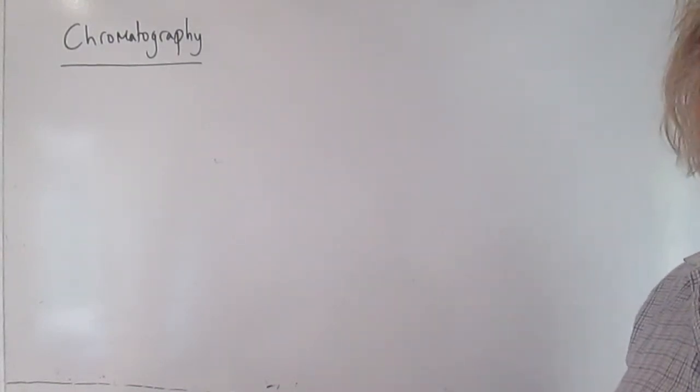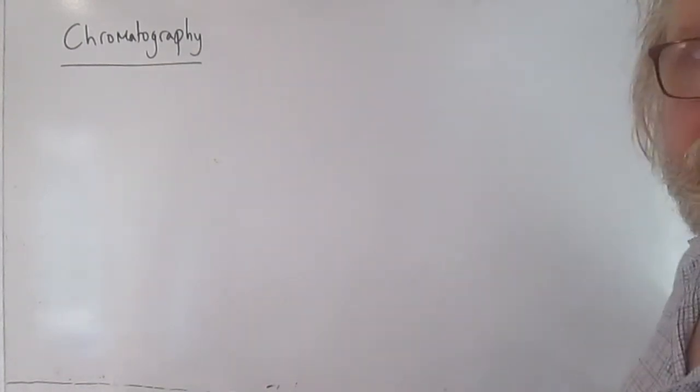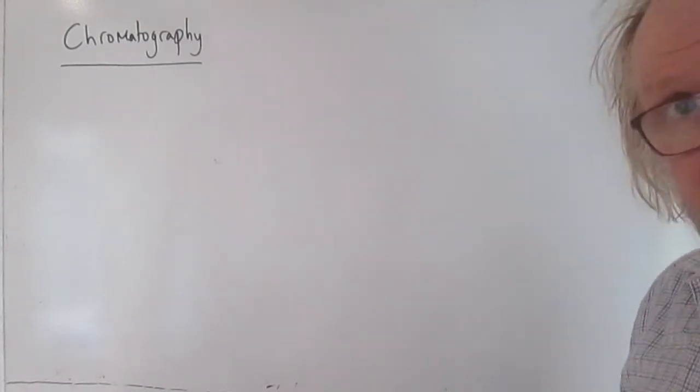One really big question that you often face in real life in chemistry is, how do you know what you've got? So if you've made something by a reaction, or if you've purified something out from nature or whatever, the question is, how do you know what you've got? And there are really two aspects to that.